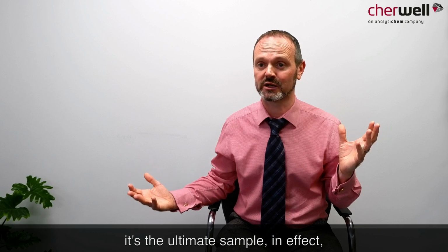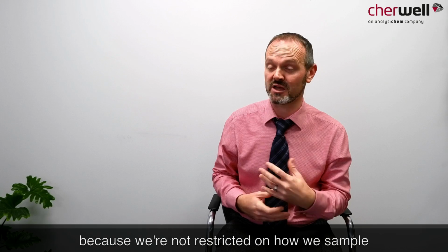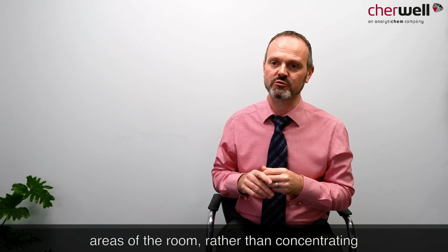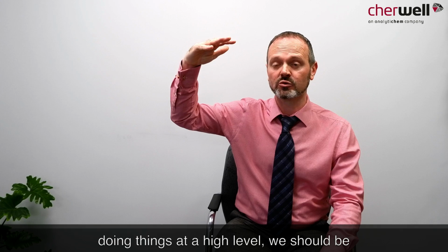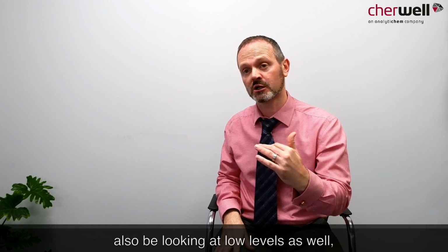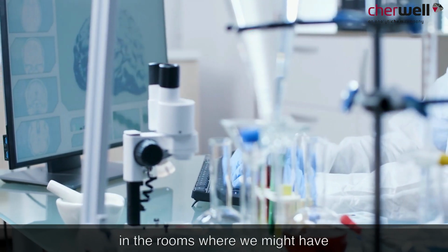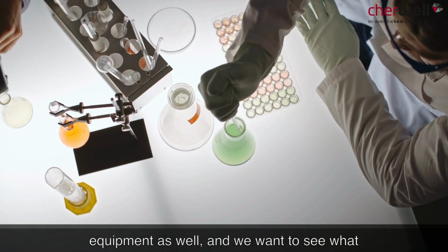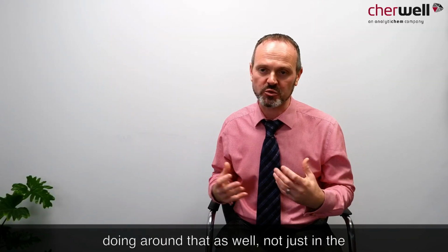It's the ultimate sample in effect, because we're not restricted on how we sample for an airflow visualization. We should be doing things at different heights in different areas of the room rather than concentrating just at the working height. So we should be doing things at a high level, at a medium level, but we should also be looking at low levels, because we've got things like furniture and tables actually in the rooms where we might have work taking place, as well as equipment. And we want to see what the airflow or the air currents are actually doing around that as well, not just in the open room or the open environment itself.